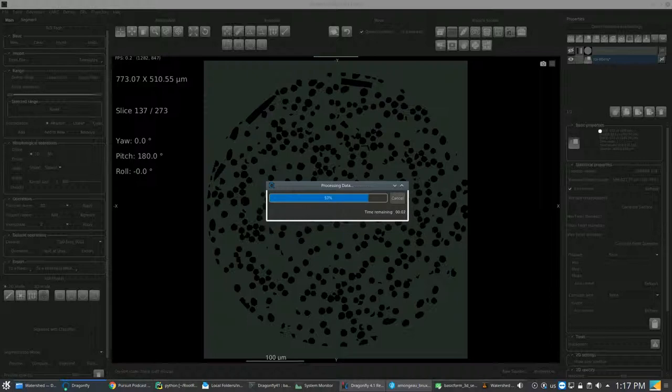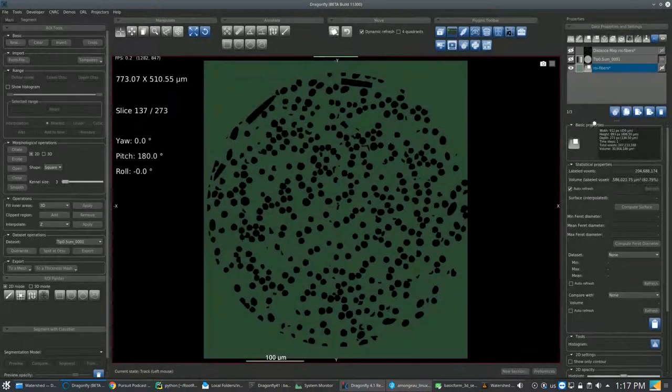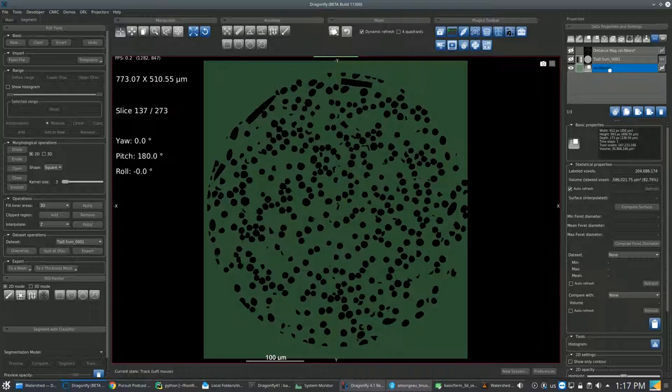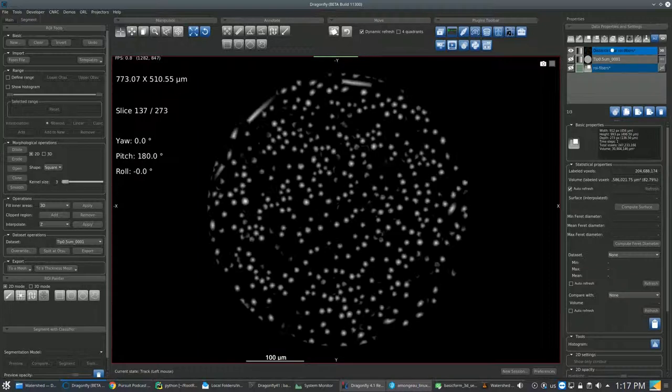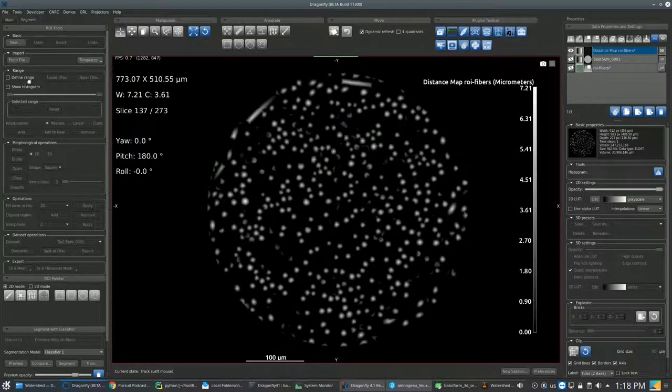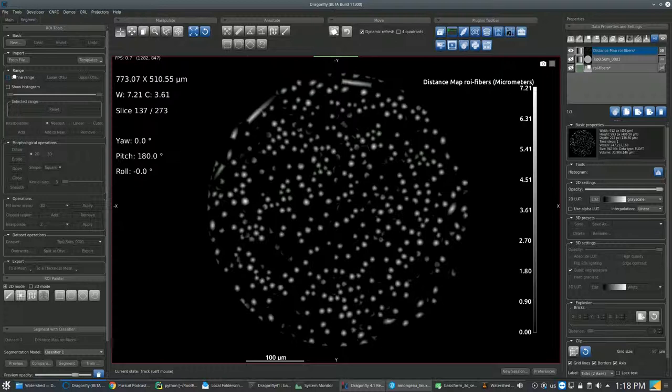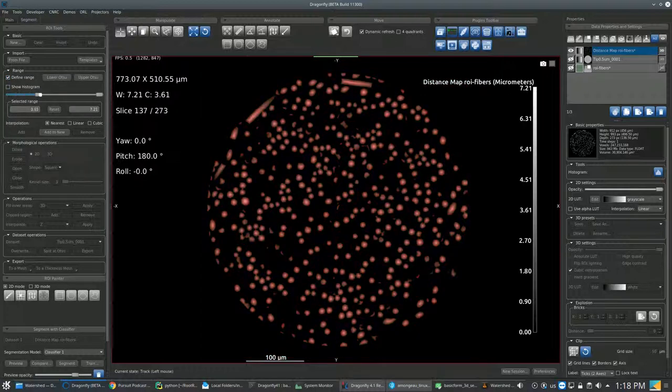Next, after processing, you get back to the object list and hide everything but the Distance Map item. Then you go to the ROI tab Tools. In Range, click on Define Range.